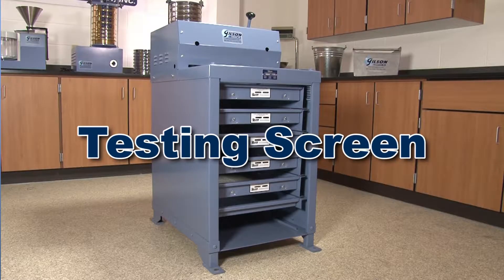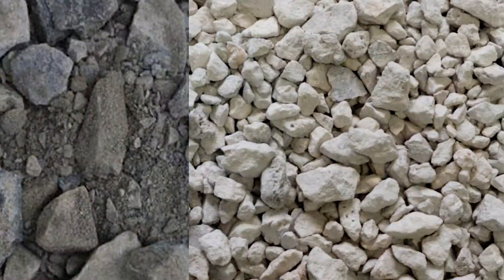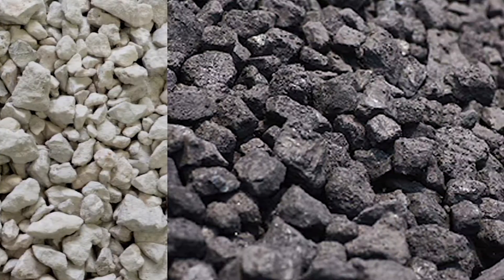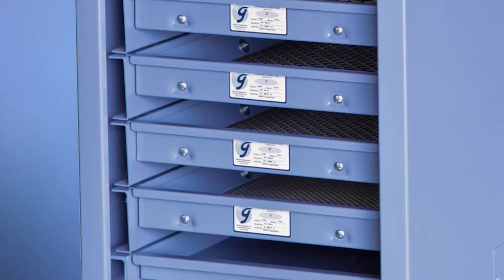The Gilson Testing Screen is ideal for particle size determinations on large samples of aggregate, slag, ores, and other coarse materials. Gilson offers models that can accommodate up to seven screen trays.